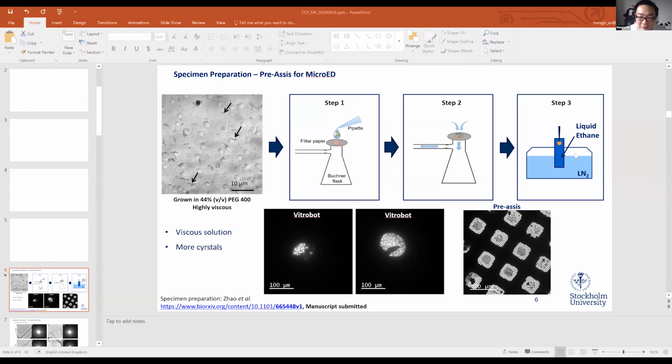And the second question about crystal cracking, we haven't seen any crystal cracking yet, I think. The reason is that crystals actually like to bring liquid with them, so it's very difficult to dehydrate a crystal sample using this kind of method. And that brings me to another point I forgot to mention: for ligand binding, a smaller crystal has less chance to crack compared to large crystals. With microcrystals, we haven't seen anything cracking. Even if they crack, we can probably put a smaller beam on it and collect data. So small is not a problem.